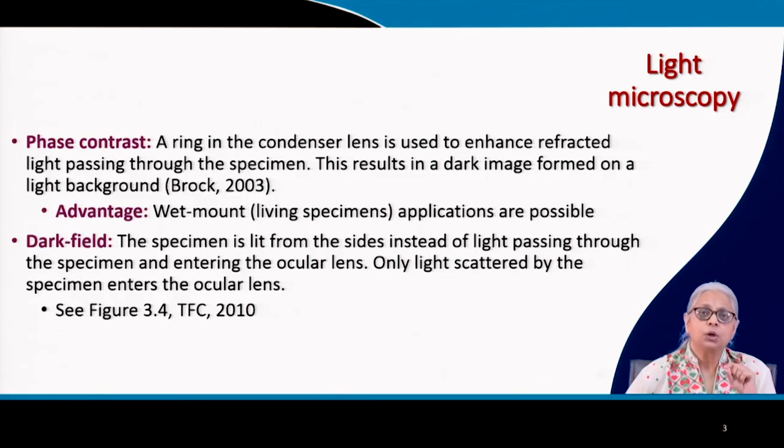Now, depending on the organelles in the sample, each of these organelles is going to have small differences in refractive indices, and because of that the path length is going to be altered. So the direction of the light is going to be altered, which is shown with red arrows, and the light that is transmitted right through the specimen, that is unaltered, is shown in blue.